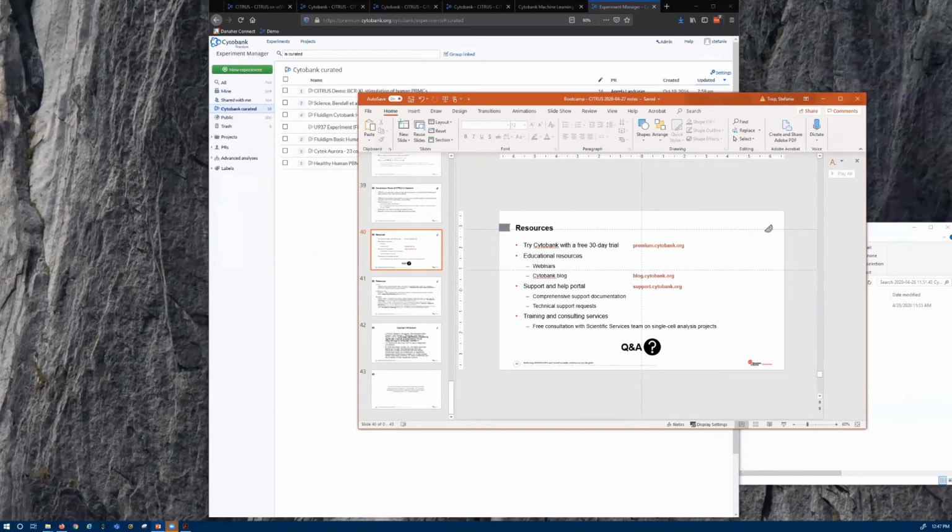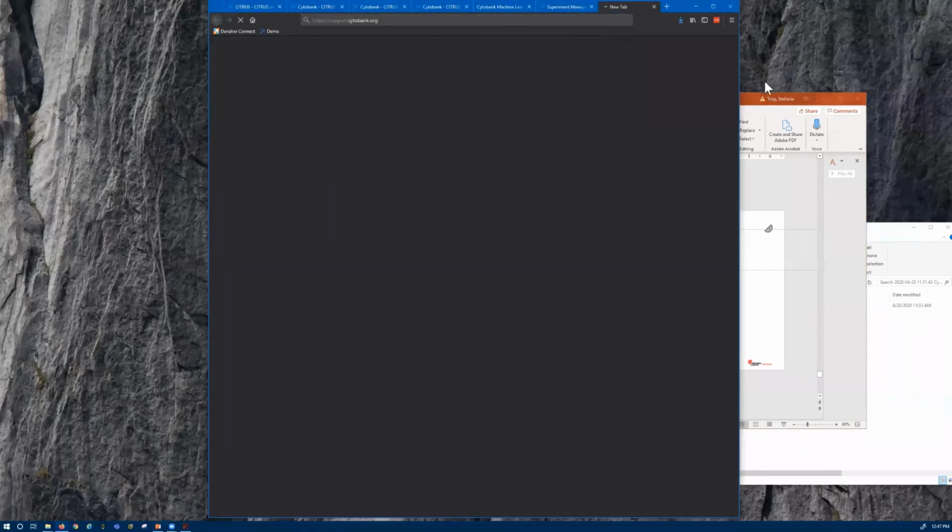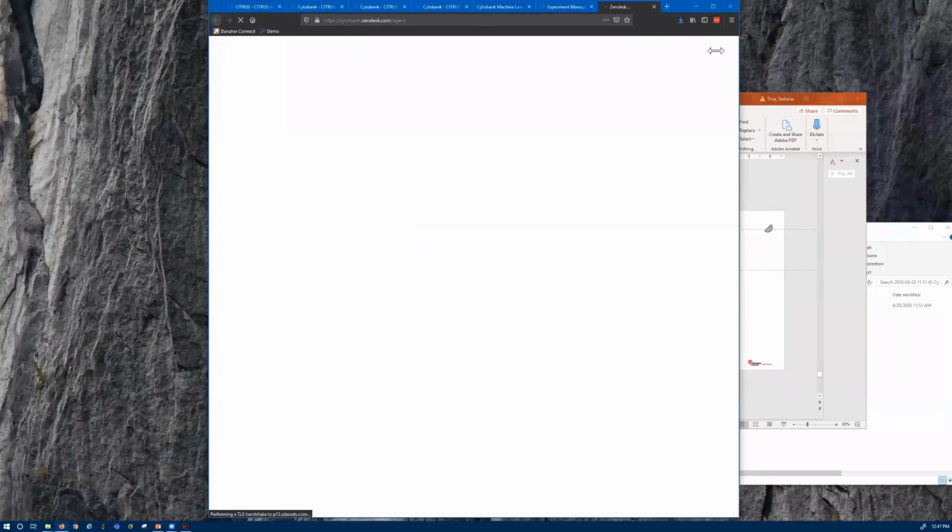And actually, I want to remind everyone, Citrus has three different statistical testing methods: SAM, PAM, and LASSO. And I think the FlowSOM plus non-parametric test approach is similar to the SAM method, because the non-parametric test will test the variables one by one.